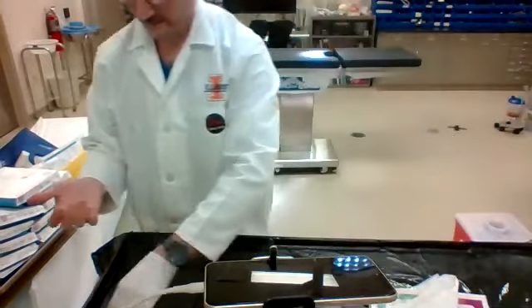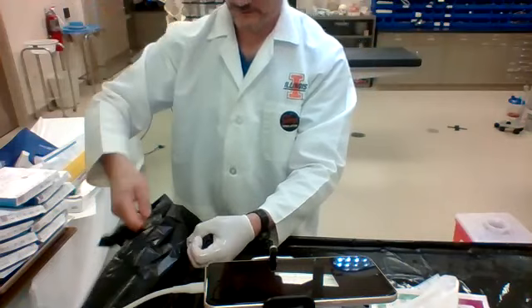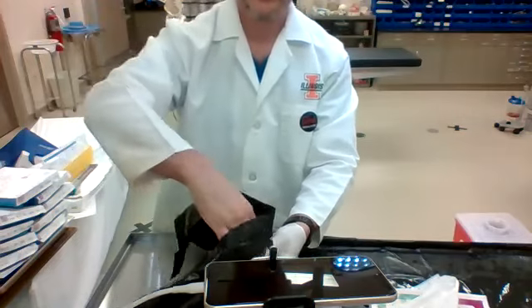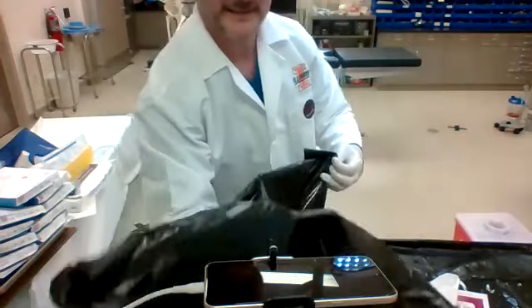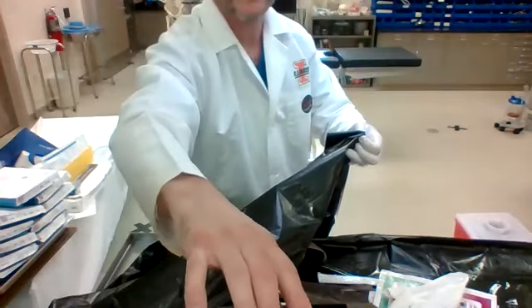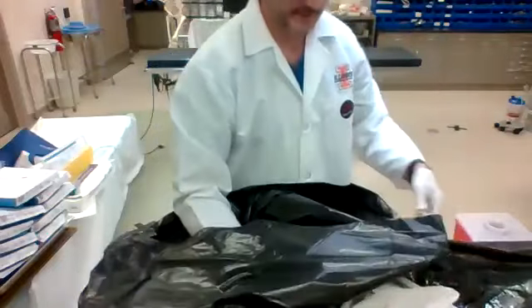Clean hand, dirty hand. I can touch all I want with this hand. Move it around. But I'm going to always keep my dirty hand on the side with the fish. Clean hand went right underneath, opens the bag. My hand is inside the bag, nice and protected. I'm reaching in. See, reaching back in here. Dirty hand still on the outside of the bag. Clean hand way inside. I grabbed a hold of my fish like I'm wearing a glove, but I'm not.